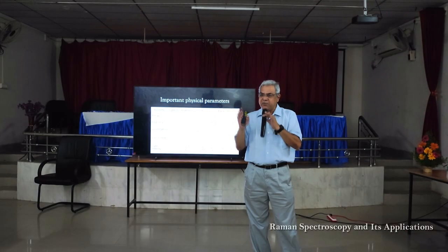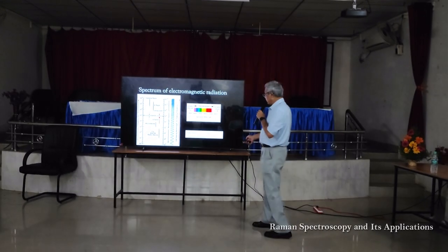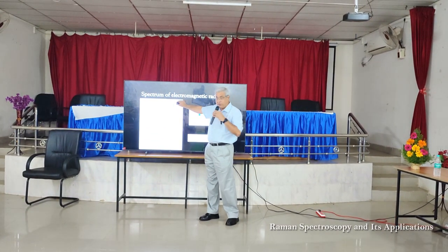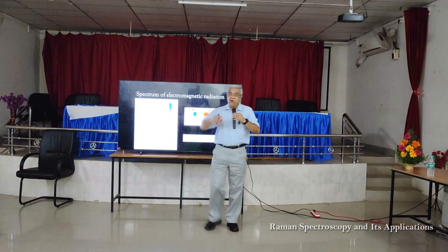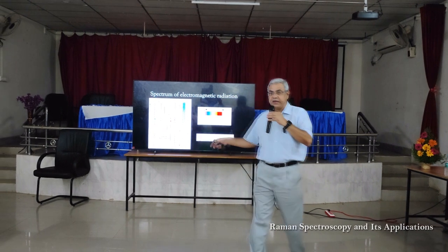The energy of the radiation, if we measure, will give you an important characteristic. We'll get back to that. Okay, this is the electromagnetic spectrum. These are gamma rays: short wavelength, high frequency, and high energy. And these are the radio waves: long wavelength, small frequency, and small energy.